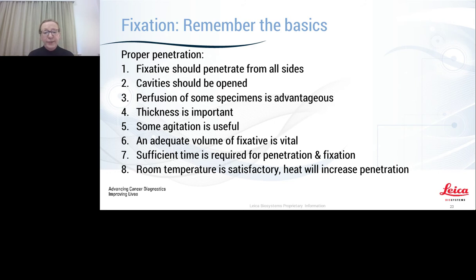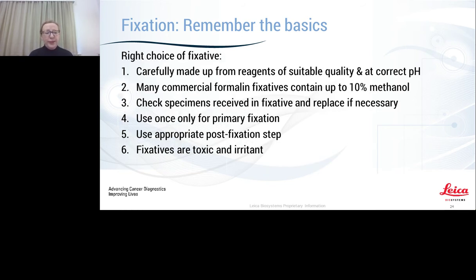An adequate volume of fixative is vital. As I said earlier, 1 in 20 is a rule of thumb, certainly never less than 1 in 10. Sufficient time is required for penetration and fixation, up to 24 hours. As you can see, the 6 to 72 hours is given for breast tissues, particularly if someone wants to do an ER or PR, which is an IHC. But 24 hours, if you have 24 hours, is really considered ideal. Room temperature is satisfactory, but heat will increase penetration. But remember, excessive heat during fixation might also cause other metabolic reactions to occur. So it's a balance. 37 degrees would be perhaps sufficient for fixation heat.